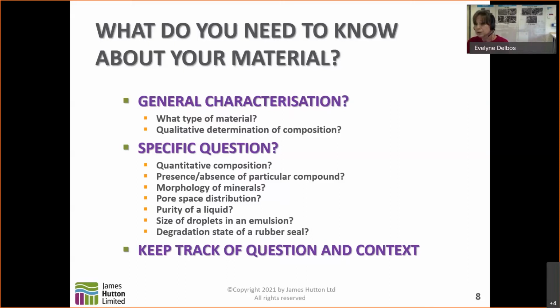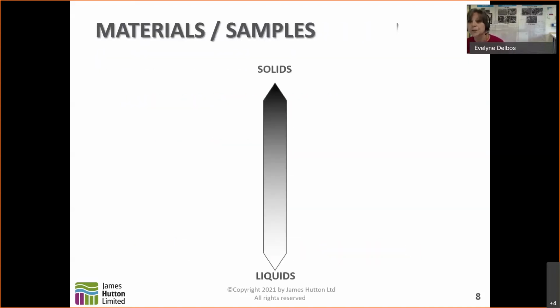So without knowing this, when it passes from one contractor to the next, it can be that we perform an FTIR analysis, but the results are probably possibly useless if we have not looked at the proper part of the sample. Next slide, please. So what type of material can we have a look at?